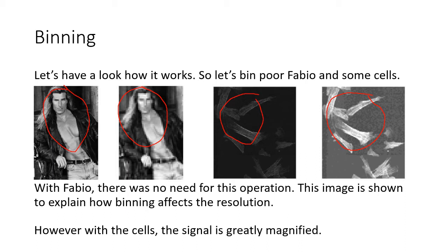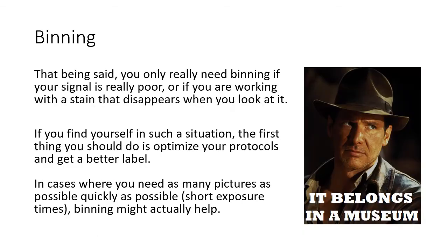So basically this is a last-resort method that you should use only when your signal is so poor that nothing else helps. As I said, you only really need binning if your signal is really poor or if you're working with a stain that disappears when you look at it.